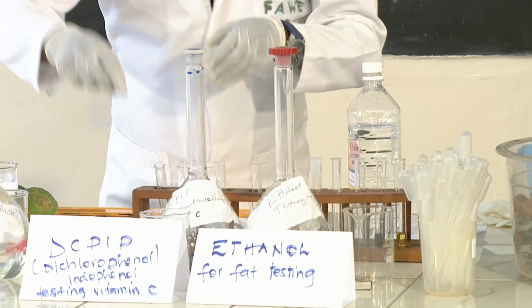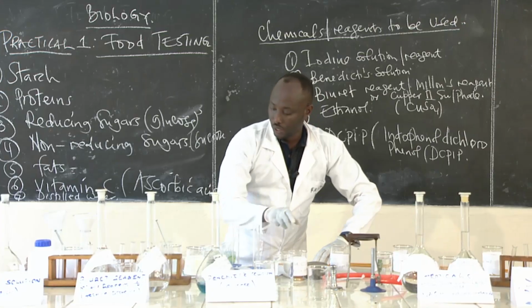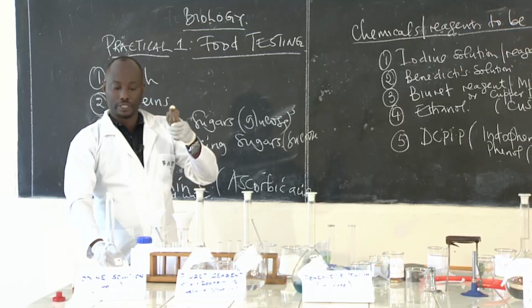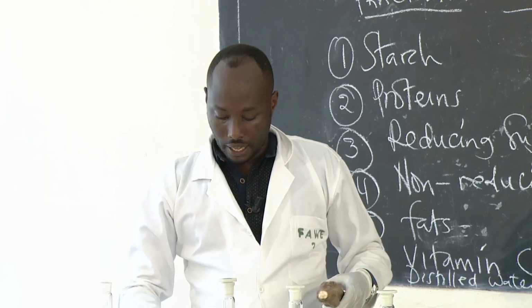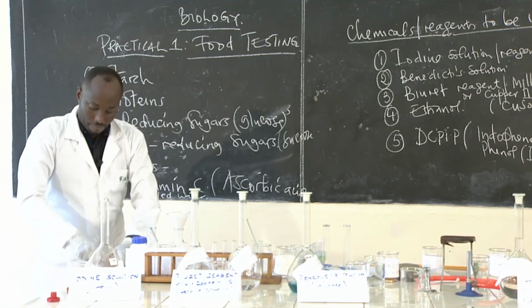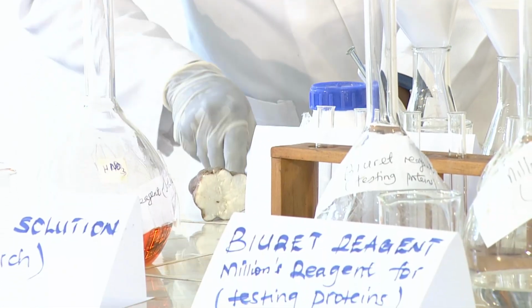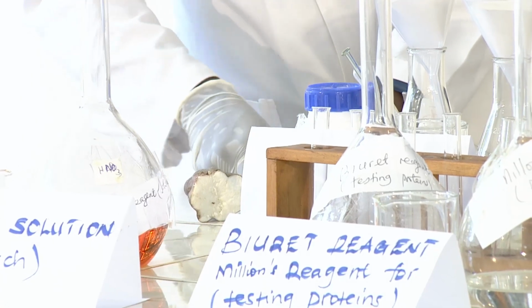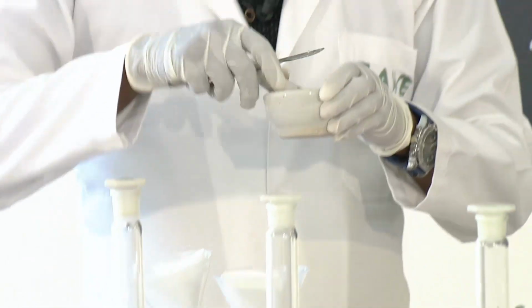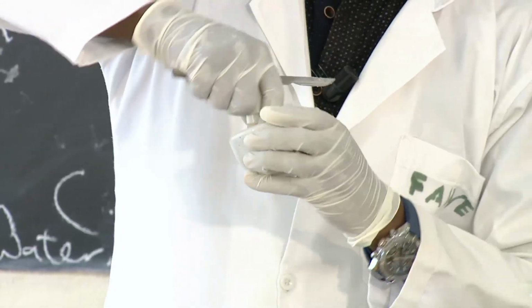Okay. Now we are going to test for the presence of starch in this food. Will it contain starch? I will use my knife, as you can see. I extract a small piece of it and put it into a mortar. I try to crush it into a paste to see if we have the same results.